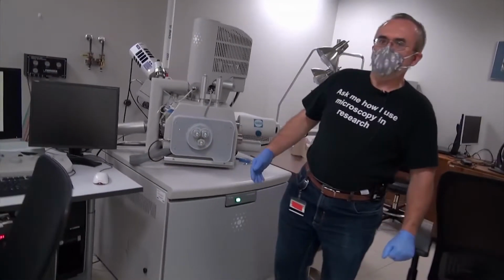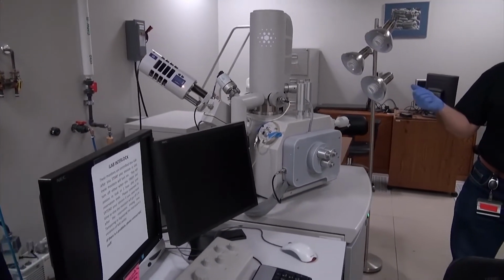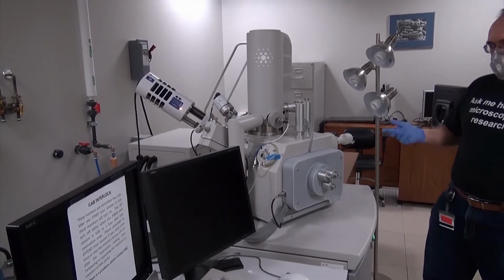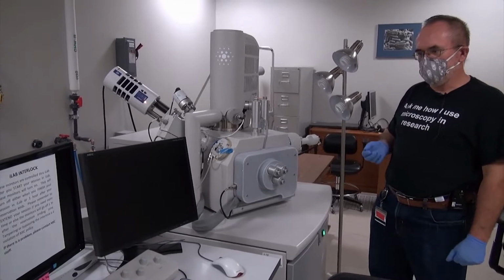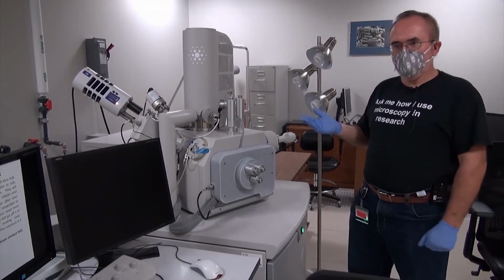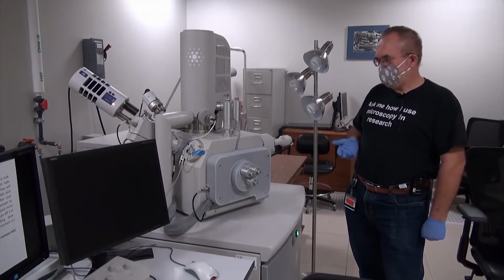So this is our field emission scanning electron microscope, the Quanta 600 SEM from FEI, or now Thermo Fisher. This instrument can work in both high vacuum, high resolution mode, but it also is capable of handling low vacuum or even partially hydrated samples in the presence of water vapor in the system, non-conductive samples.